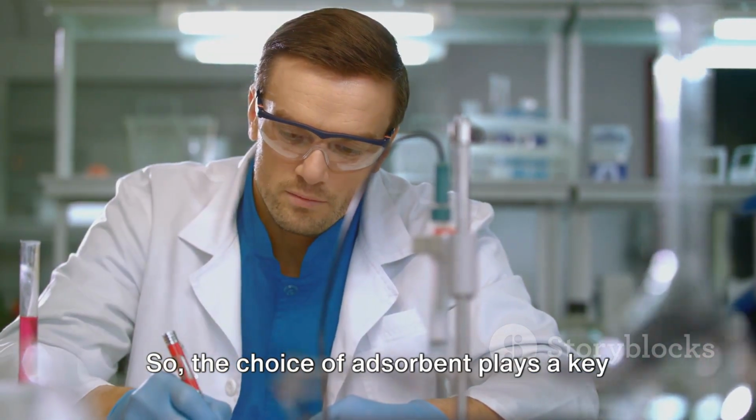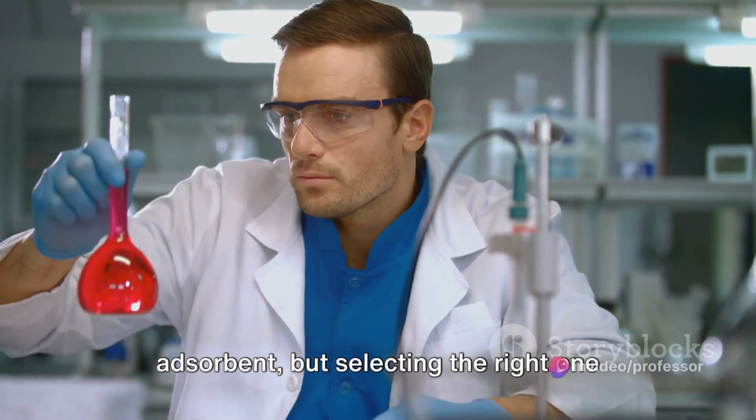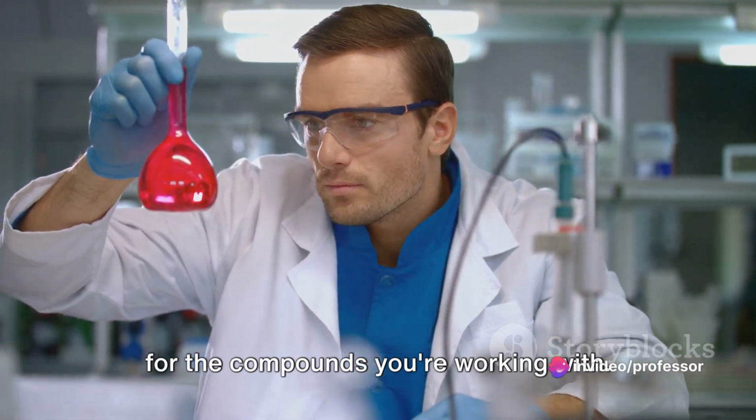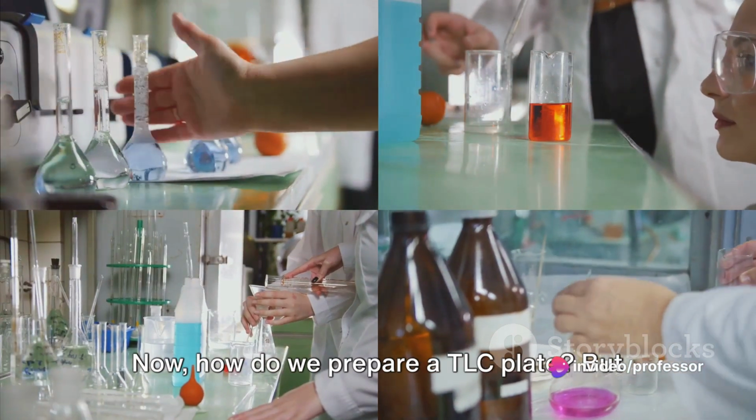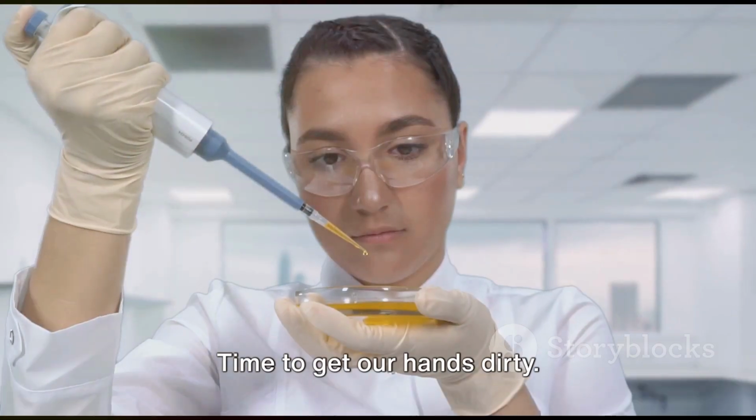So the choice of adsorbent plays a key role in TLC. It's not just about picking any adsorbent, but selecting the right one that will provide the optimal separation for the compounds you're working with. Now, how do we prepare a TLC plate? But that's a story for another scene. Stay tuned. Time to get our hands dirty.